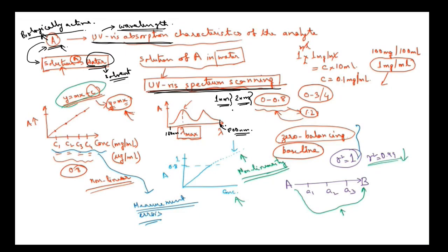In some cases, if you want a very fast scan, you can go for a scanning step of 10 nanometers and so on. So in the case of 10 nanometer, what will it do at 190? After 190, it will go for 200 nanometer scanning.